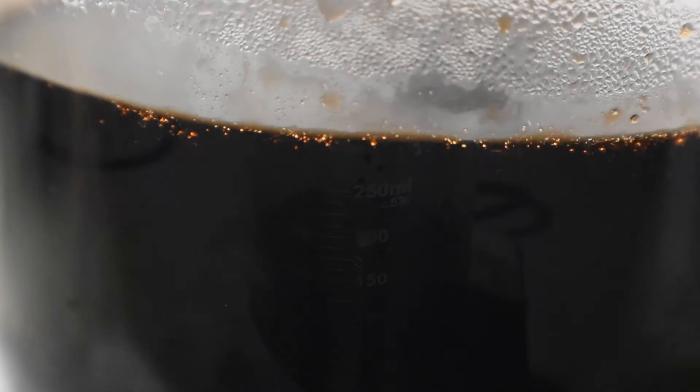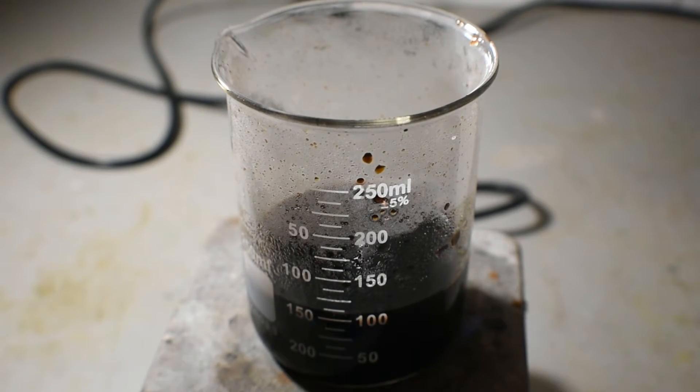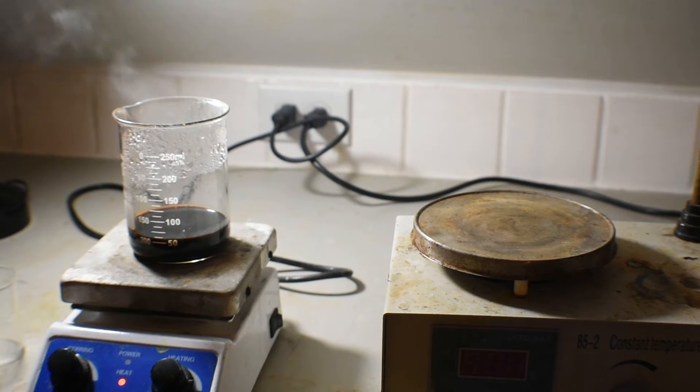Now I'm going to bring this mixture to a light boil and evaporate it down to 60 ml. Now that the volume has been reduced, I'm going to take it off heat and allow it to cool to near room temperature.